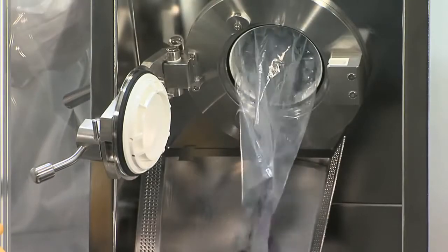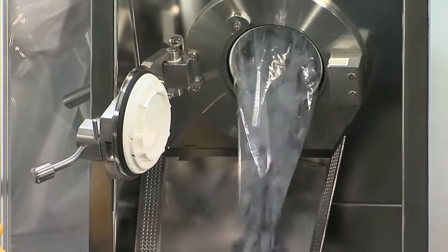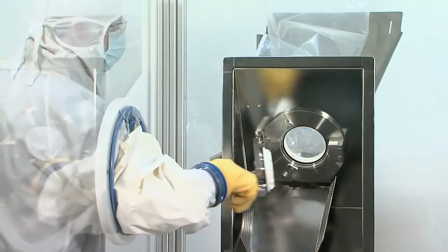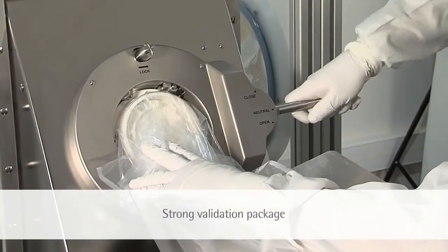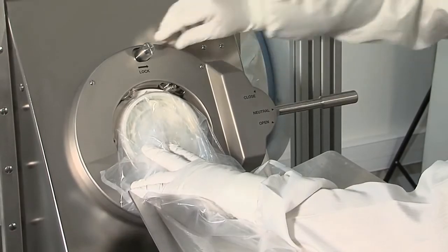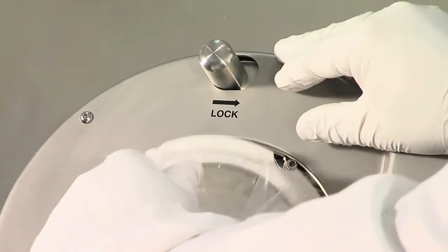With its 110mm useful diameter, the BioSafe system allows for the quick and easy transfer of sterile components, including 13-32mm vial stoppers. The BioSafe technology is a validated solution for aseptic fill and finish applications.